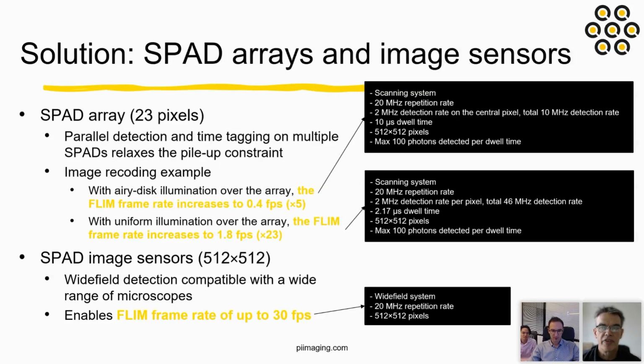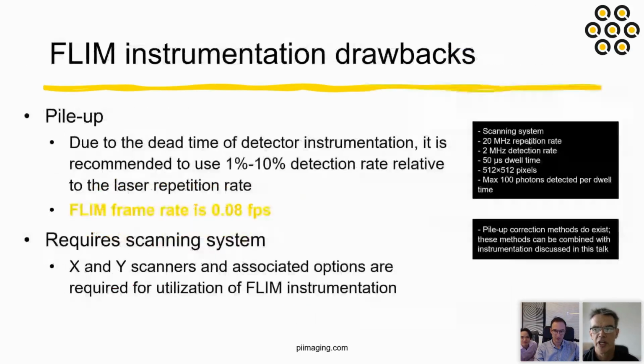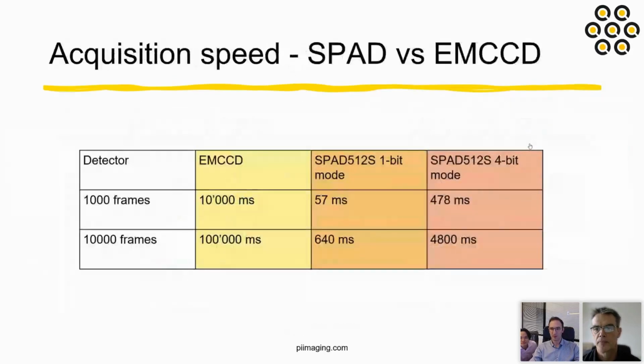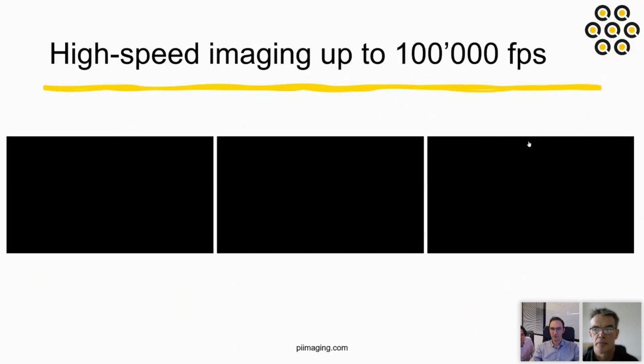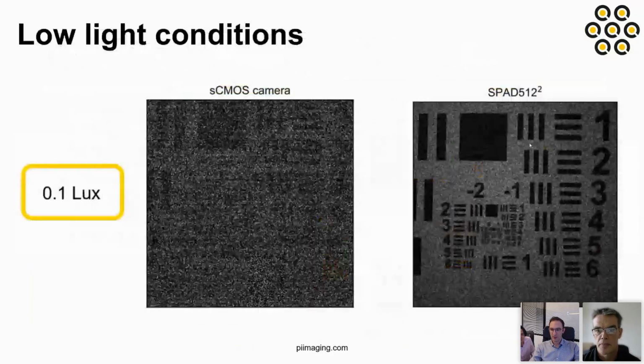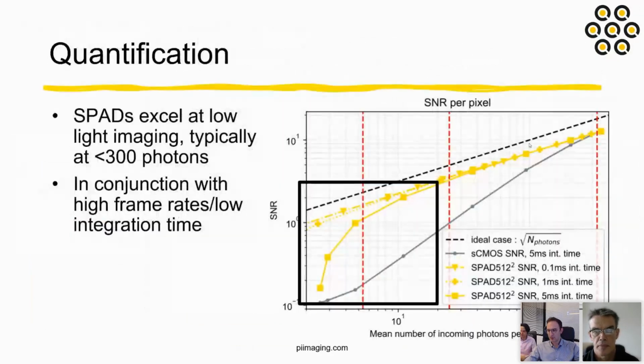There was a point of clarification when you were comparing the SPAD and the CMOS. Can you go back and elaborate on why the dark count rate increased with the longer integration time? Absolutely. Just to clarify, the dark count rate did not change. It's only the dark counts which are accumulated that have increased.